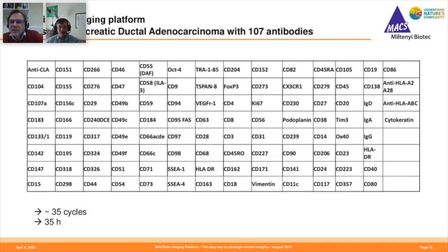So something that a few people have asked that is probably quite important as well is the autofluorescence. Now it takes an image at the beginning of every single round as an autofluorescence subtraction. If you're working in a really autofluorescent sample, perhaps it's better to stick to the more red LEDs, obviously, and you'd be more careful about that. But yeah, there is some autofluorescence subtraction going on in there.